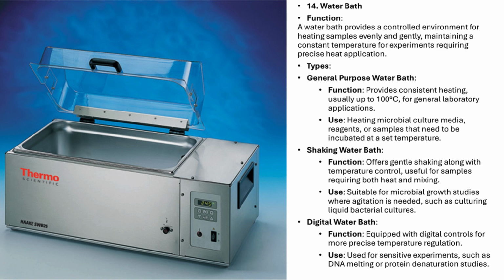There are a few different types of water baths, each designed to meet specific needs in the lab. General purpose water bath. The general purpose water bath is the most common and is designed to provide consistent heating, typically up to 100 degrees Celsius. It's perfect for general laboratory applications, like heating microbial culture media, reagents, or samples that need to be incubated at a set temperature. Shaking water bath. If you need both heat and gentle agitation, the shaking water bath is ideal.